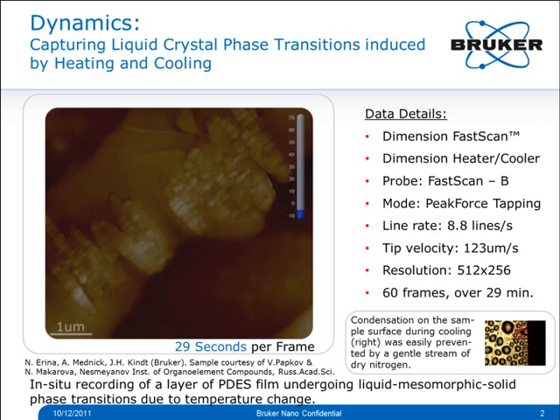The whole movie consists of 60 frames recorded over 29 minutes at a frame rate of 29 seconds per frame. Using the Dimension Heater Cooler together with the Dimension FastScan system is currently an open configuration, so when cooling one needs to be concerned with air moisture condensing on the sample surface — you can see a picture of that in the bottom right corner. This was easily prevented by setting up a stream of dry gas with a nozzle several centimeters away from the sample stage and directing a gentle stream of dry gas at the sample.